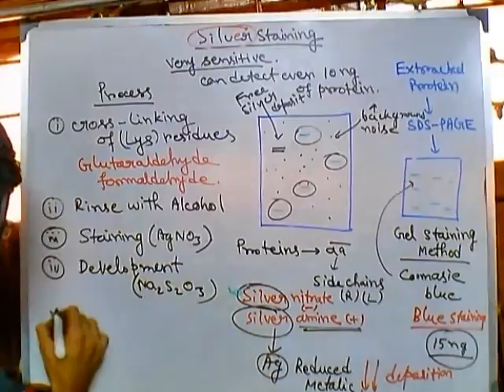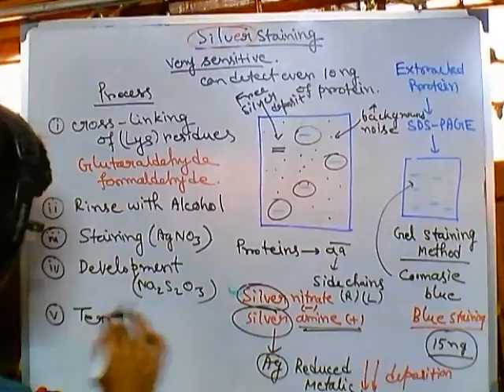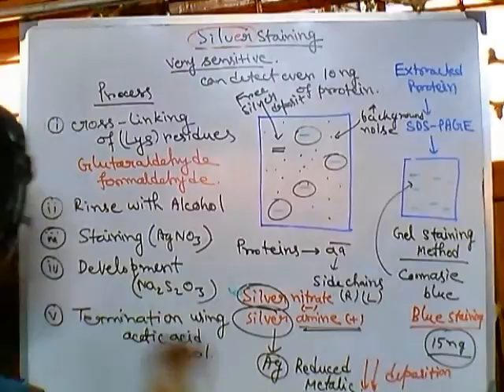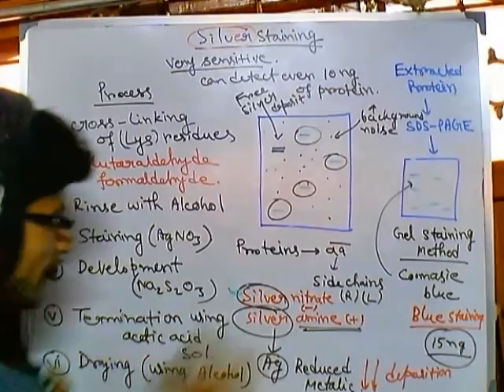Now after that, we need to terminate the reaction using acetic acid solution, and we also put in sodium acetate and these solutions. And the final step is the drying using alcohol. So these are basically the step-by-step process of how we use this.